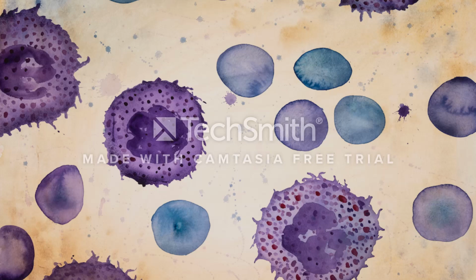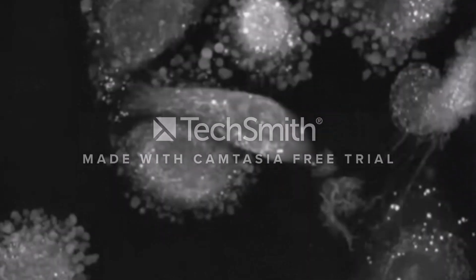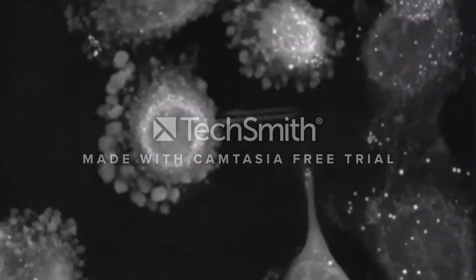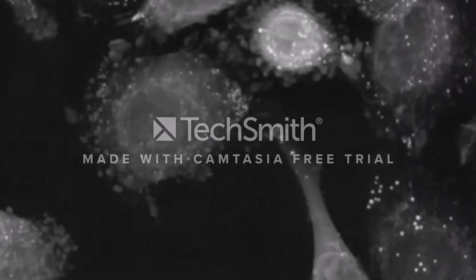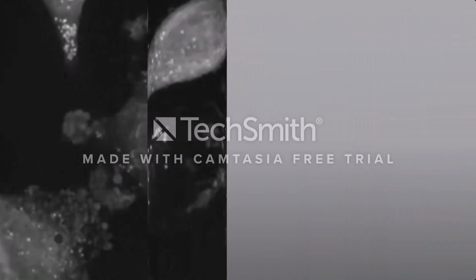They also help the body maintain a stable internal environment. The 3D datasets include images of lung cancer cells infused with green fluorescent protein to facilitate more visualization and analysis to detect whether an individual is infected with the disease or not.